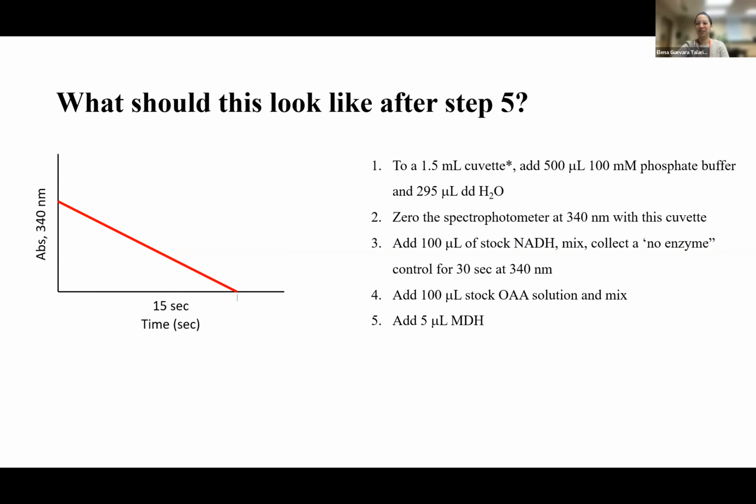That said, it's probably safer if you put it in the same sort of cryoprotectant solution that we put the MDH we make in the lab in. But again, it's still kicking, so we'll see. Well, if you're not using it that quantitatively, and you just want to say, yes, my assay is working, it's less important. Okay, good to know. Thank you. Right. Other questions? Those were the questions in the chat. Anybody else have any questions?